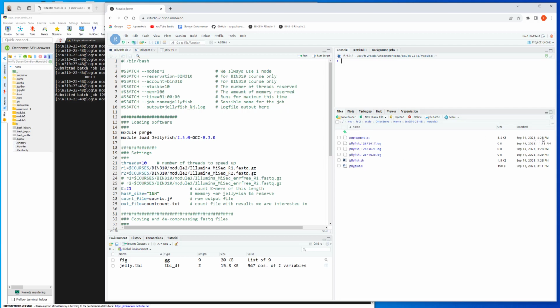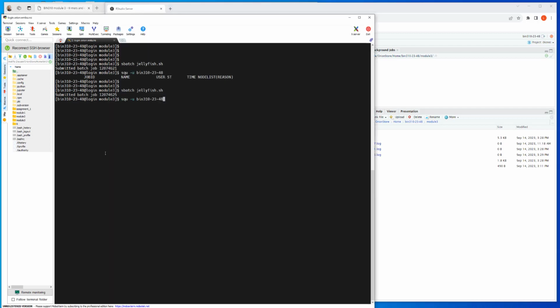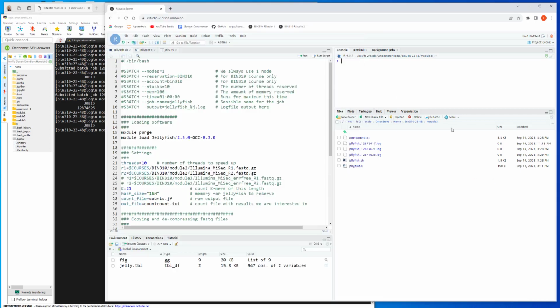You can actually look at the time of when the result file was created to verify that this is something that has been created now when you are working with this. So let me repeat this here. Yeah, it's still running. It's been running for 22 seconds, but it shouldn't take more than a minute. Now it's done. Like this, yeah, 6.5 kilobytes. Let me delete these old log files now.